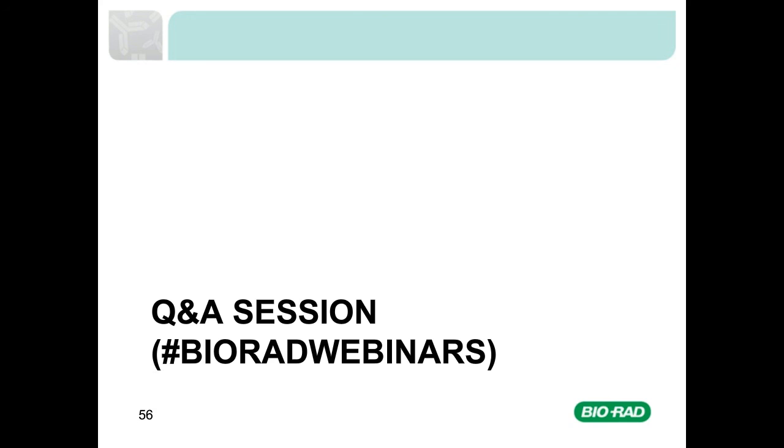Thank you, Steve. So our next question is, if there is a target left in the lysate, can you re-IP and is it worth it? In answer to whether you can re-IP a lysate, this depends on how efficient your IP is, which I mean how well your antibody binds to your protein of interest and how abundant that target protein is in your lysate. If your target is highly abundant, it might be possible that you've saturated your antibody during the incubation step of the IP process, and that repeating this process will result in pull down of your target protein during the second IP, which will probably be almost as efficient as the first IP.